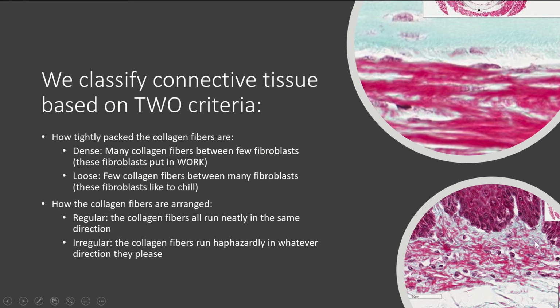All right, if I look at this one, here you can see all of these little darker spots are the nuclei of little fibroblasts. Those fibroblasts are making these little red things, those collagen bundles. And so if I were to say how busy these fibroblasts look, they don't look near as busy as this one.